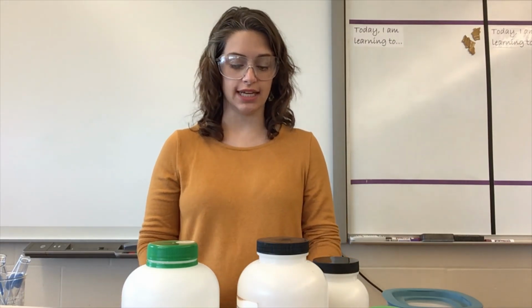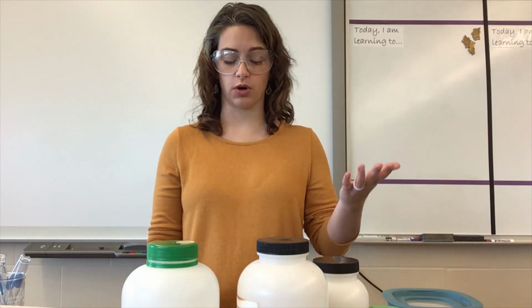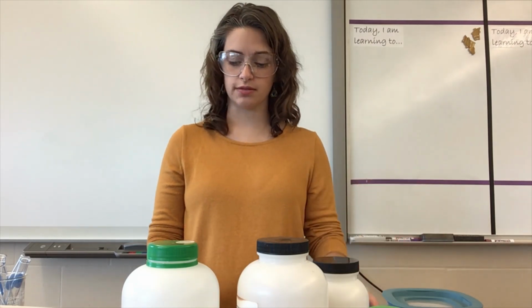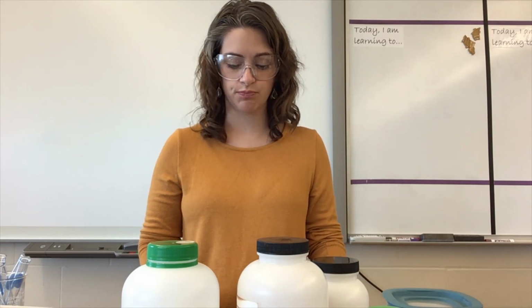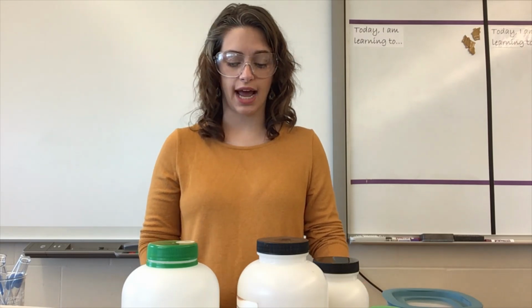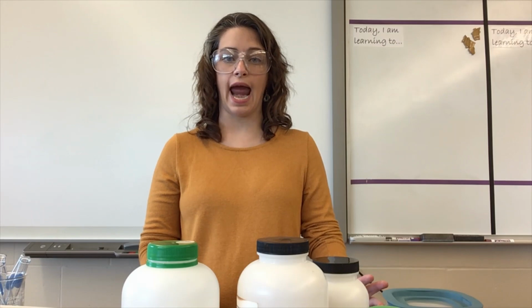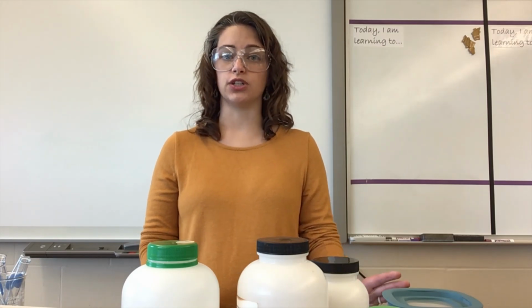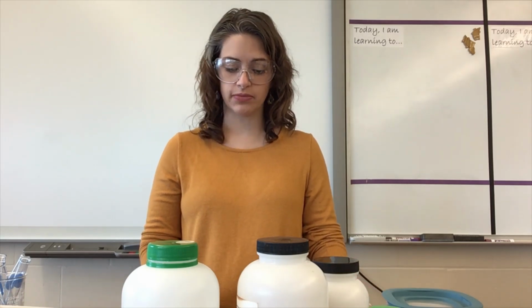Today we're going to be doing the types of compounds lab. So in our introduction, it says we already learned that compounds are made of different elements held together with chemical bonds. We also know that different elements have different properties. But what happens to those properties when these elements form compounds? This lab helps us to better understand molecular structure, which has us look at how the attractions between atoms and particles affect bulk properties.